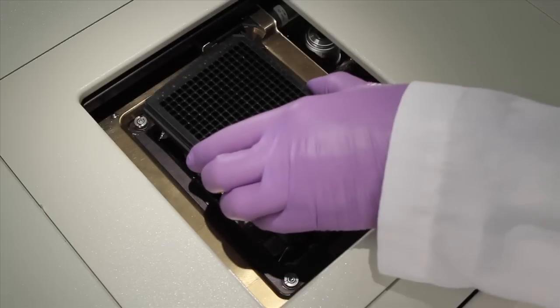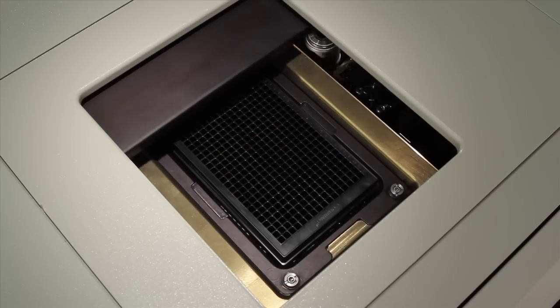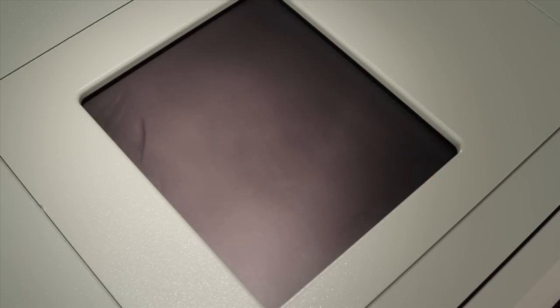Now you are ready to run your experiment. Thank you.